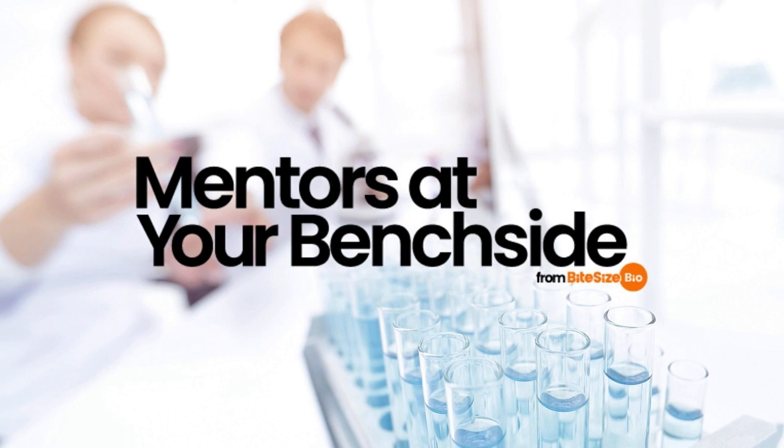Tip number 4, understand significant figures and record them correctly. The number of significant figures you use and record is critical. Specifically, significant figures provide the degree of uncertainty associated with values. Keep these consistent when measuring items repeatedly and ensure the number of significant figures you are using is appropriate for each measurement. Tip number 5, take multiple measurements.